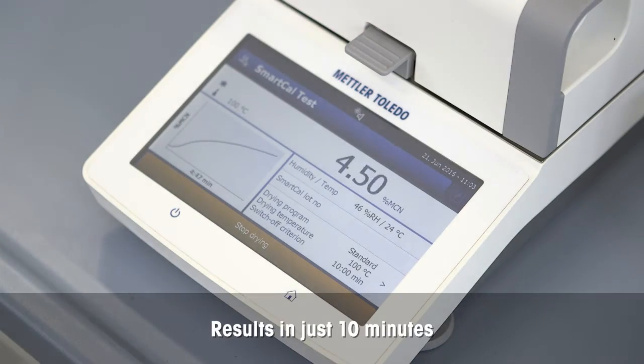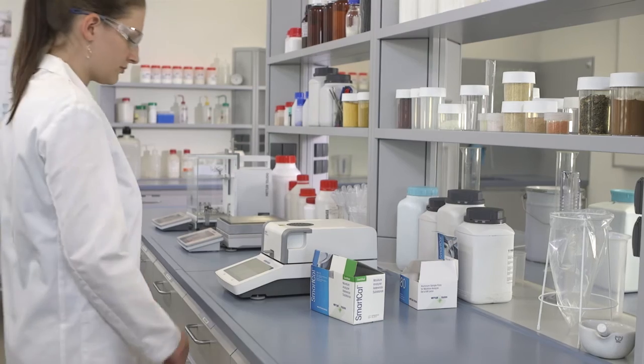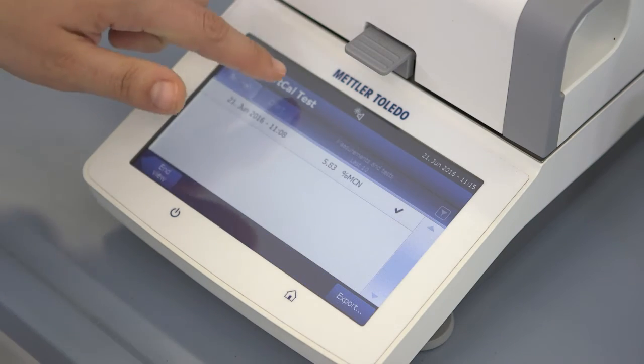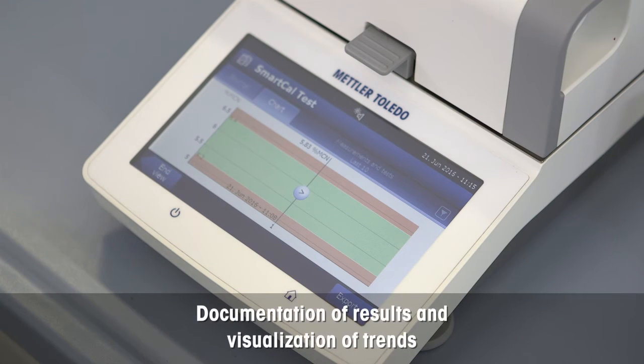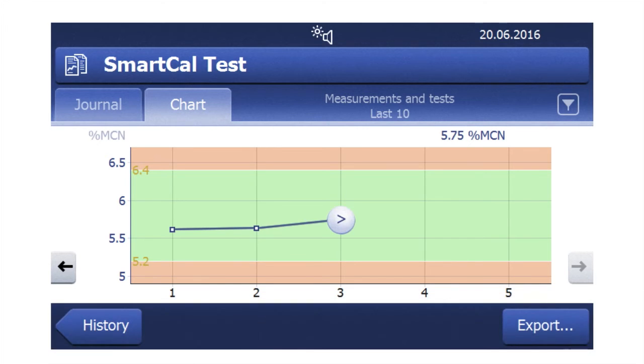The test is finished in just 10 minutes. The normalized moisture result is displayed on screen and is automatically documented in the built-in control chart. If the result lies within the set control limits, then your moisture analyzer is working correctly.